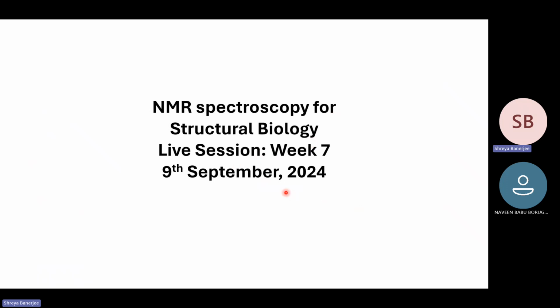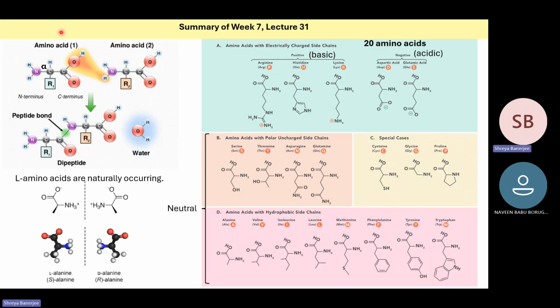In this session, as always, I'll firstly cover the videos of week 7 that Sir had gone through. I'll be going through each of the videos in short, and then we'll see some practice problems of the week 6 assignment. Up to the previous 2 classes, it was all about nucleic acids and NMR of nucleic acids. From this class, we'll start looking at proteins.